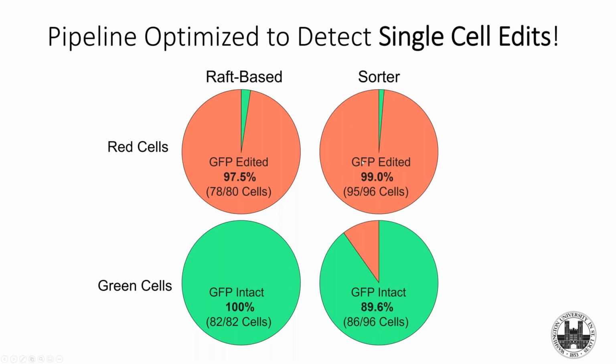This is actually expected because the flow cytometer has photomultiplier tubes, which are very, very sensitive. So if there was even just a little bit of green, this is better at seeing that. It's just an issue of detecting the phenotype. Interestingly, the opposite didn't work so well in the sorter.